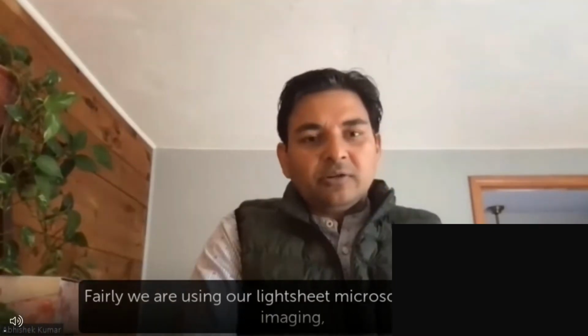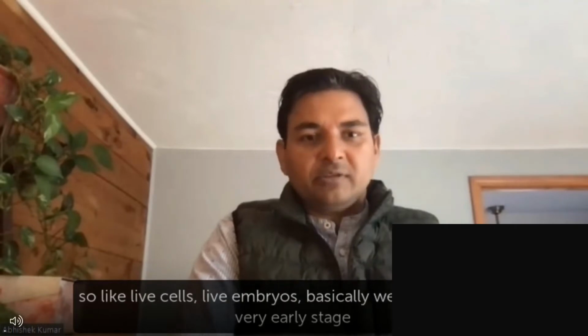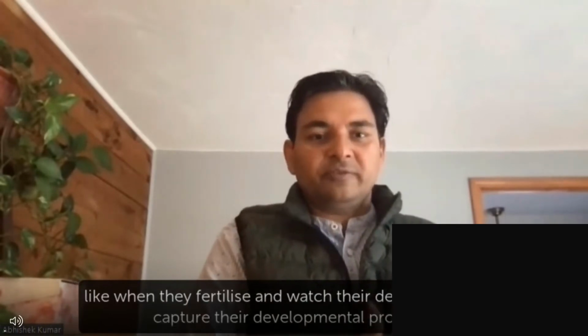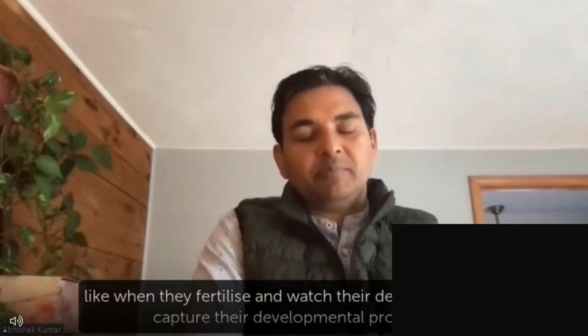Fairly, we are using our light sheet microscopes to do live imaging. So like live cells, live embryos, basically we want to start at a very early stage, like when they fertilize, and watch their development or capture their developmental process.